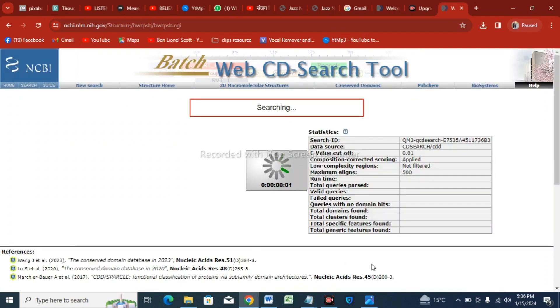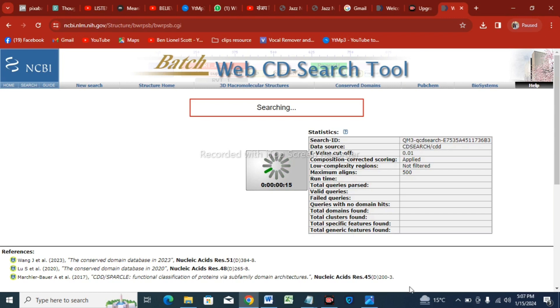This will take a little while for processing, so wait until the download option is visible. It will take one and a half minutes, and now it will take 15 to 20 seconds minimum.